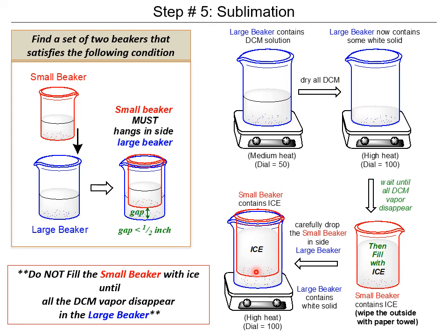Now, you really want to be careful with water, right? Because otherwise, you're not going to get many crystals to form from the caffeine. So be very careful not to have any kind of water on this ice beaker. If it does contain anything, please wipe it down before you put it into the bigger beaker so that you can get a good yield of caffeine.